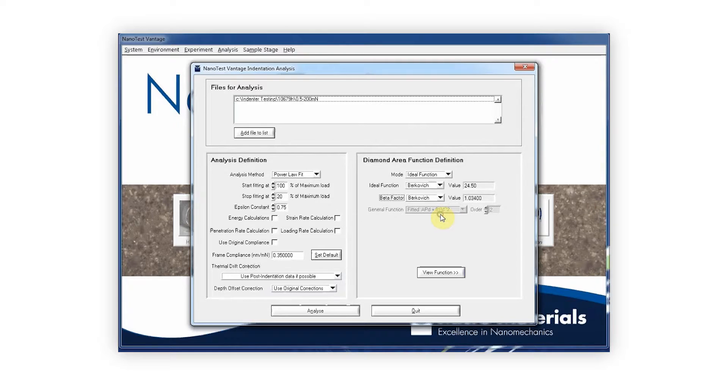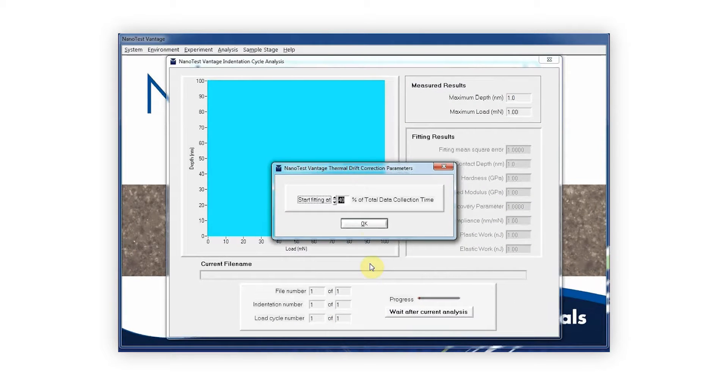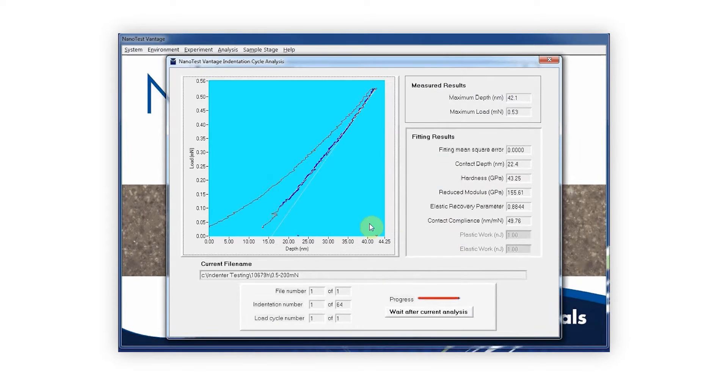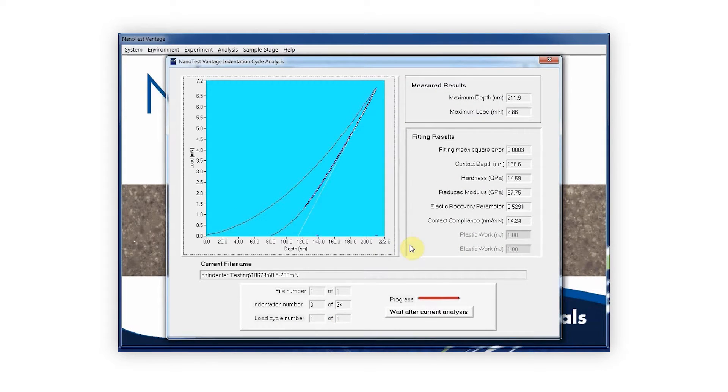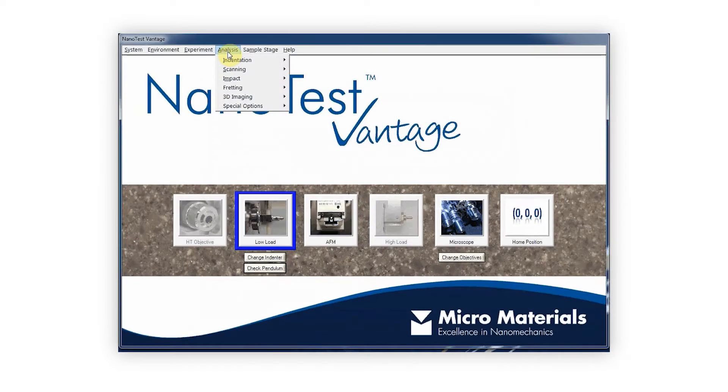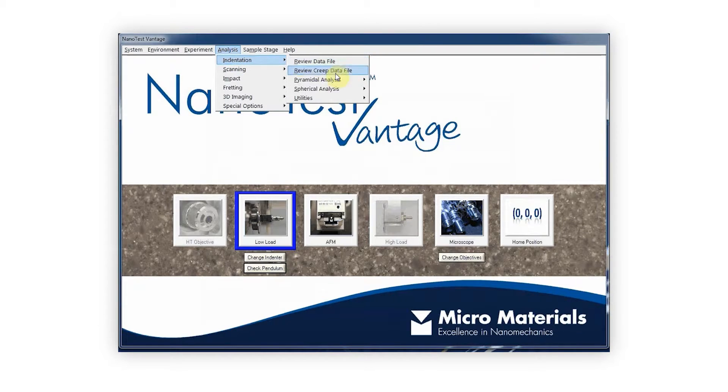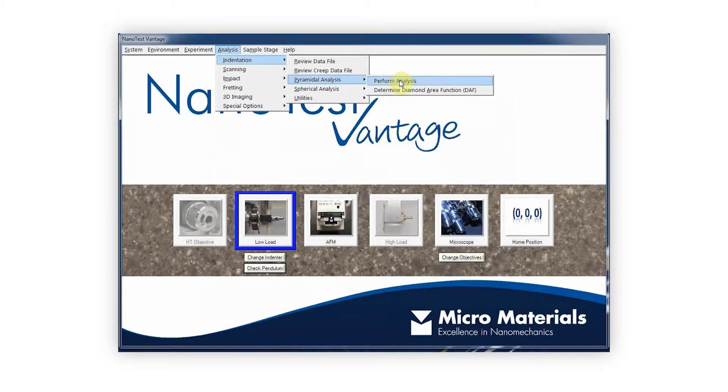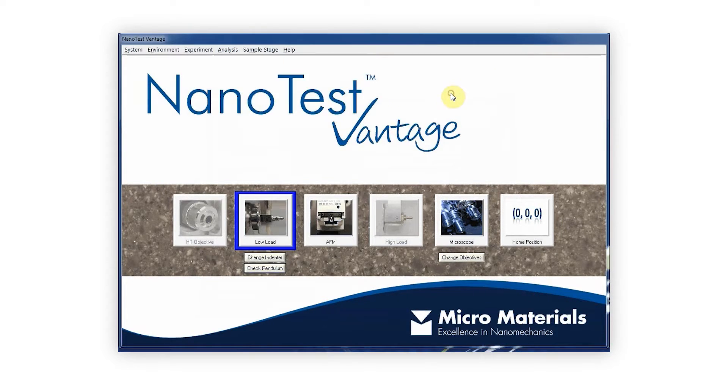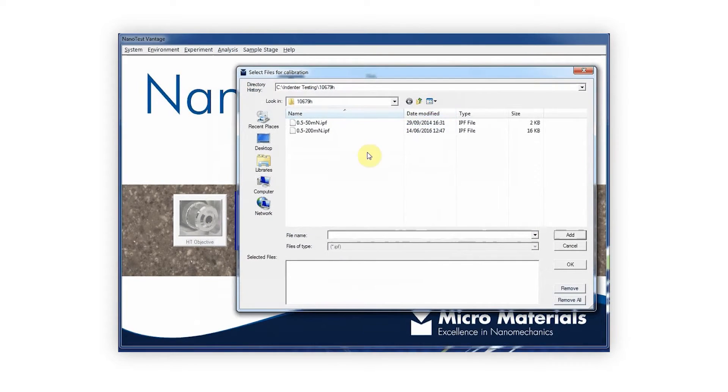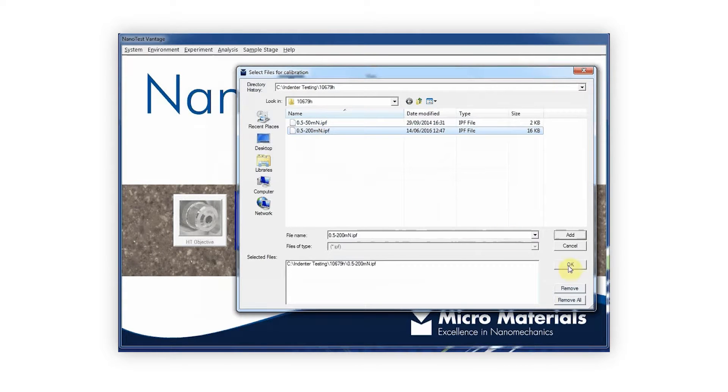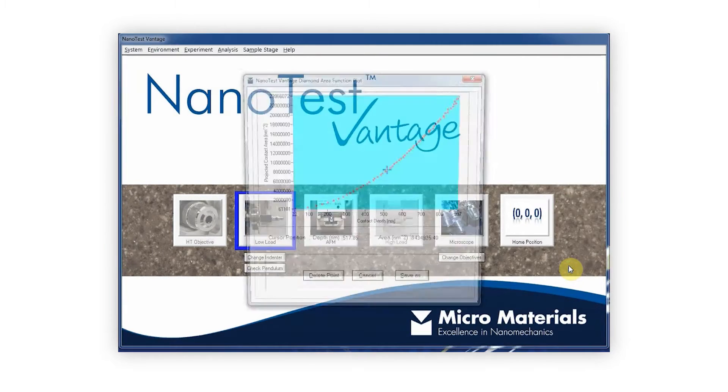Firstly, a predefined area function experiment is performed on a reference sample, usually fused silica. Once complete, automated ISO-compliant analysis protocols are used to calculate the area function for the indenter.